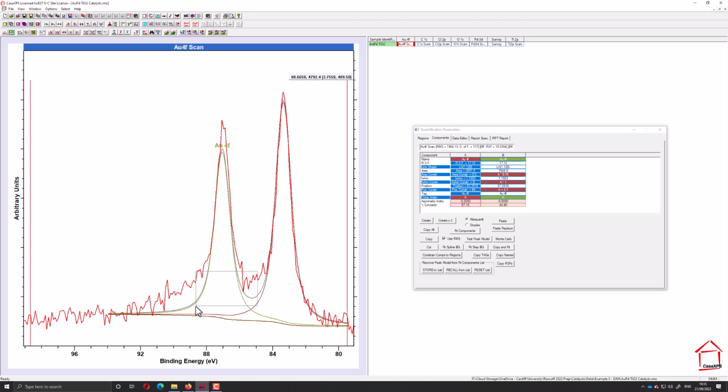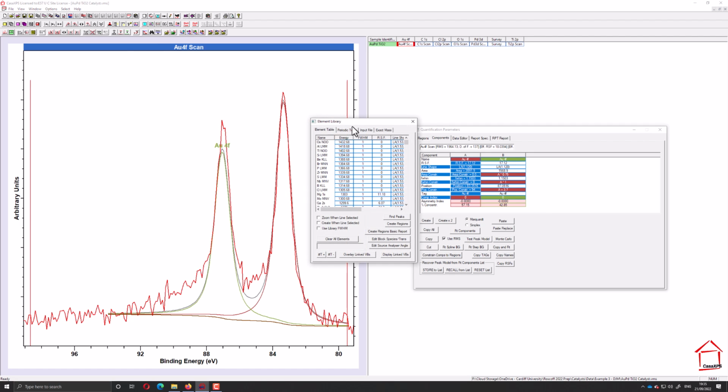And we do indeed have structure in that area. What we actually have here, and we can show by other methods that there isn't any gold 1 species in there, or even gold 3, which would be higher again, is that this gold is superimposed on a background of the palladium 4S, if I recall.